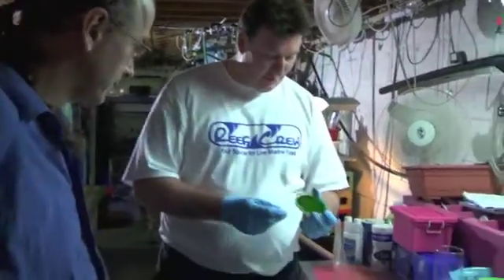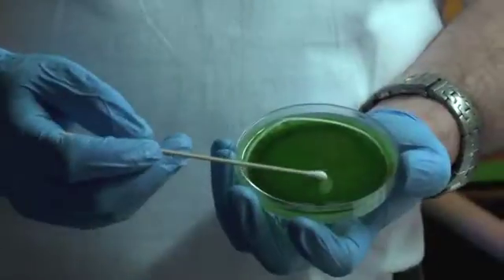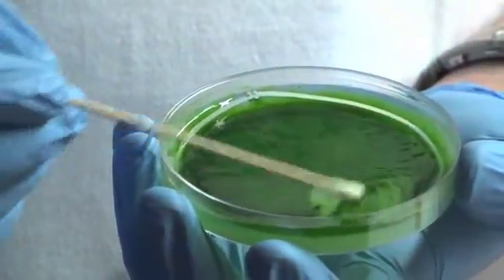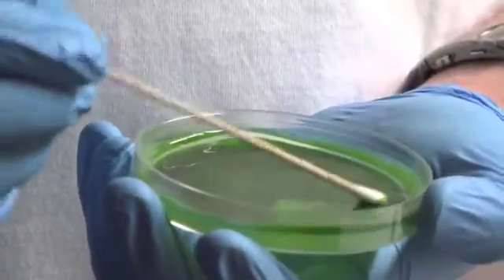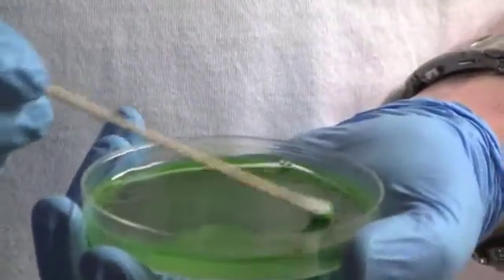So while we've been chatting, this has had a chance to sit and soak a little bit. All I'm going to do is just take the Q-tip here — and as you can see, it starts to flake away. I'm more or less just agitating the algae away from the actual agar medium underneath. Agar is a seaweed used for gelatinizing in food and lab dishes.